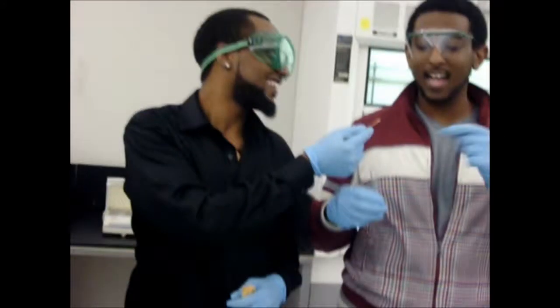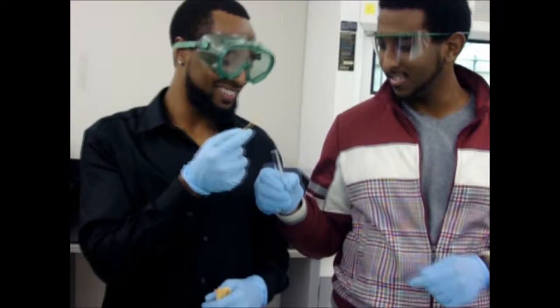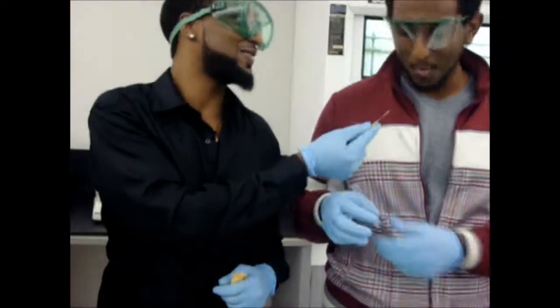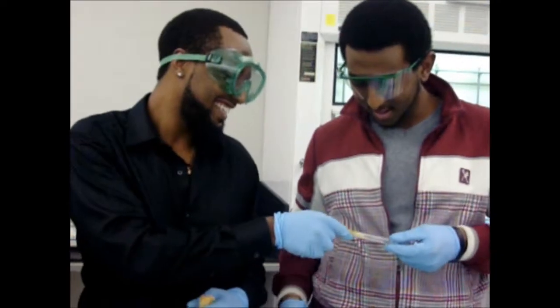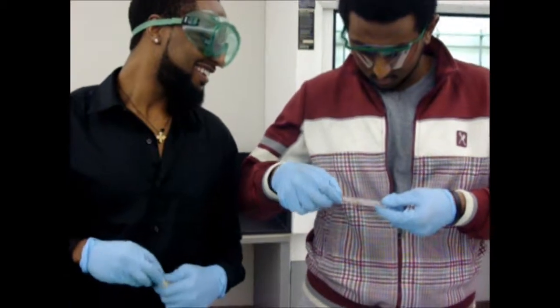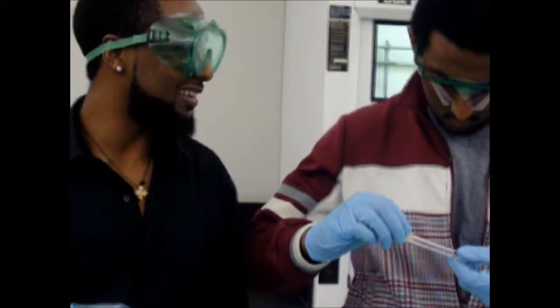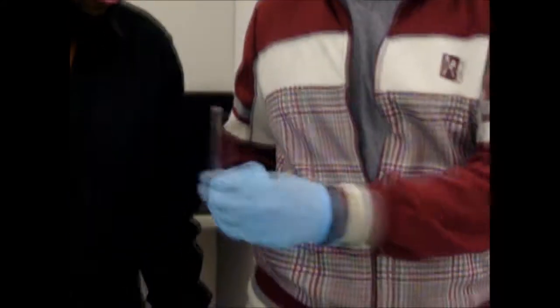No problem. Actually, I'm going to dump it right here and check it. The thing is, you have to test this without dumping in there because we have to retrieve it. So please test this for me, sir. No problem. There you go. Stick it right in there. Now, you could already see that some of the paper is already turning red once he tested it. Okay, there you go, sir.